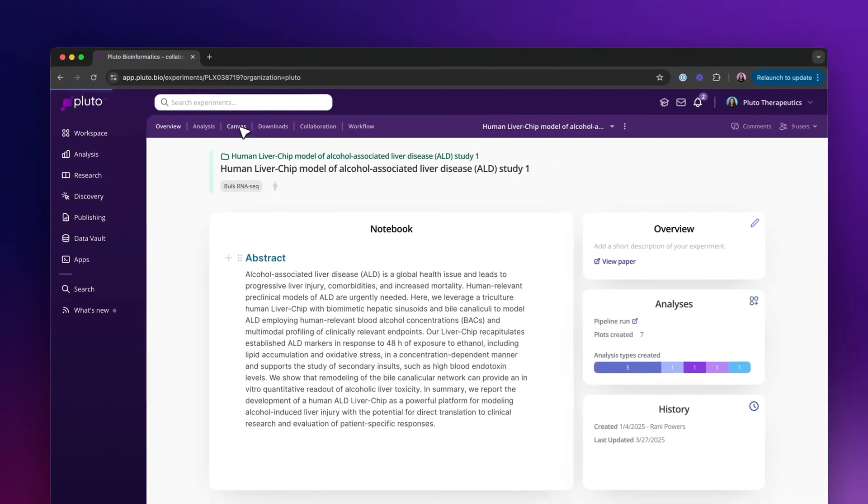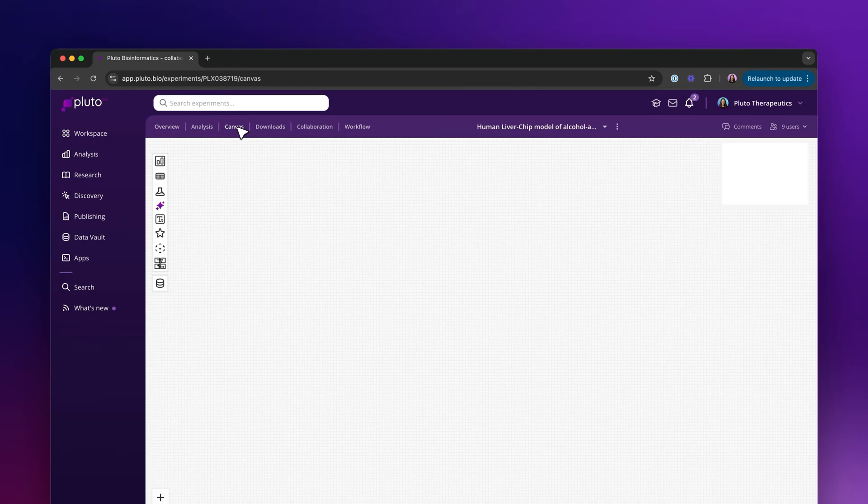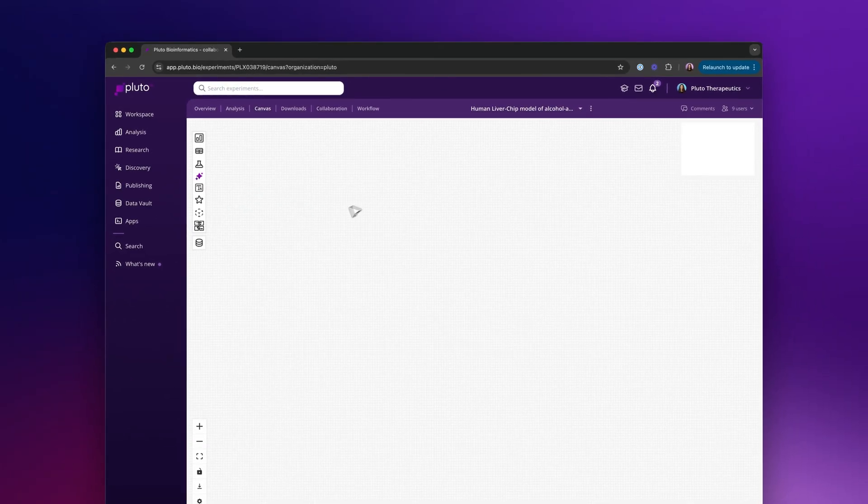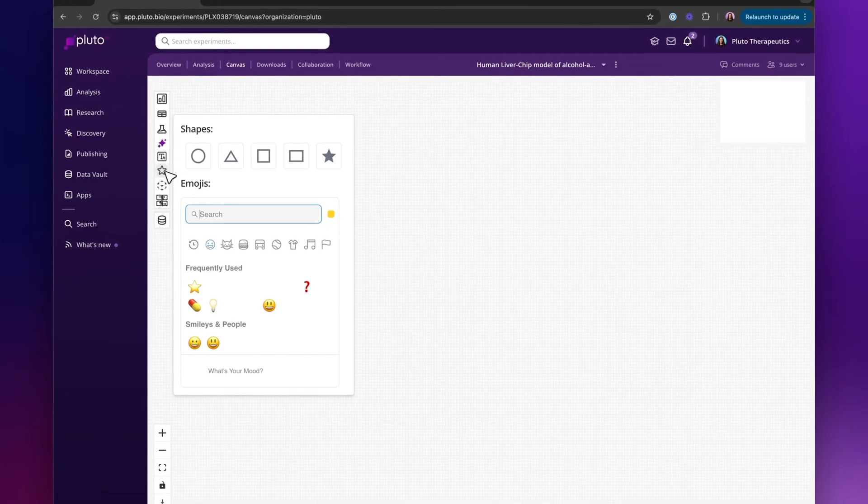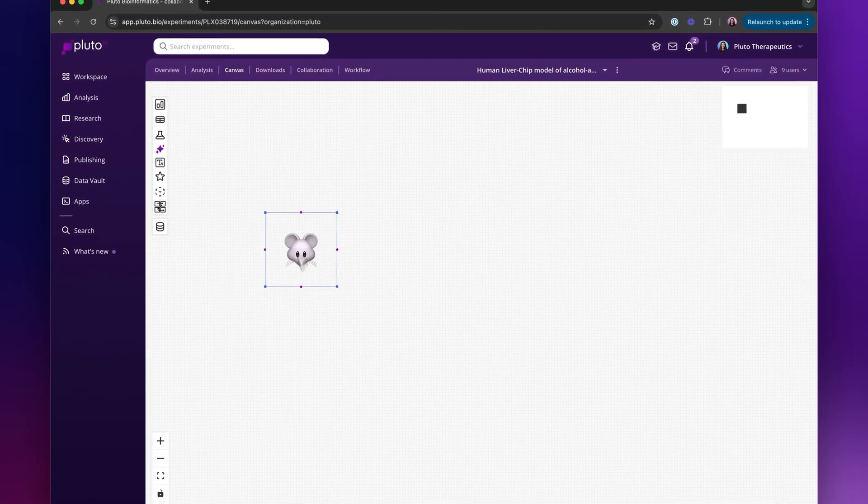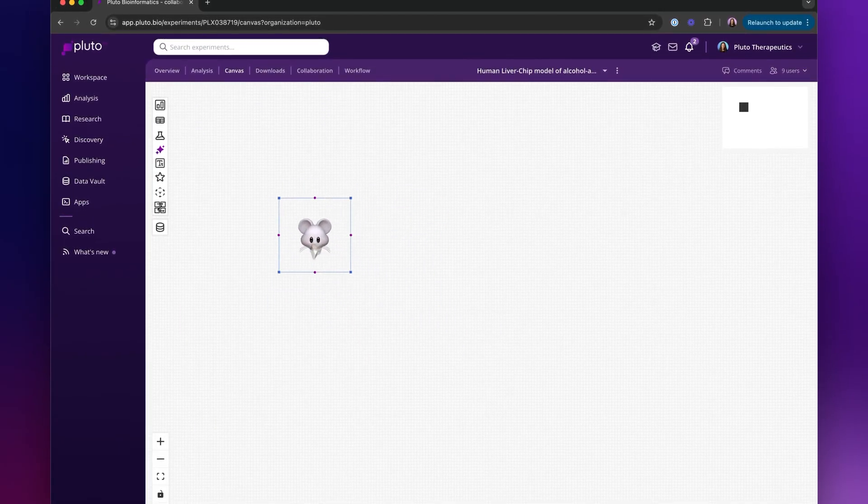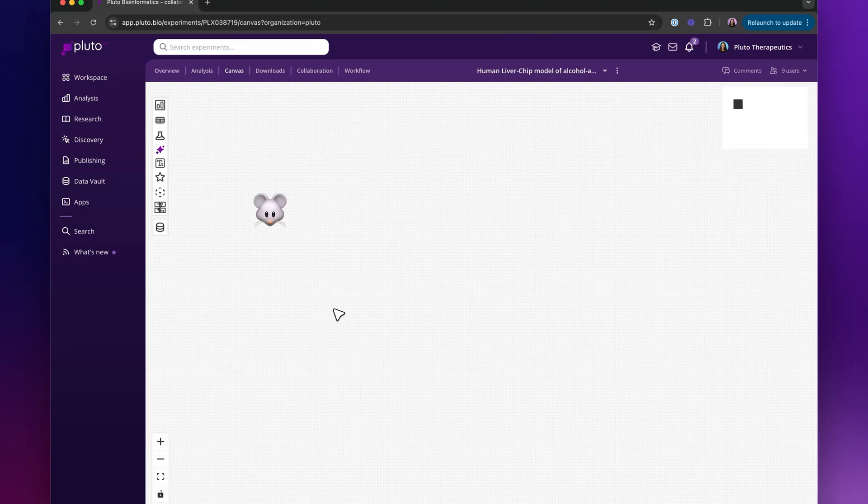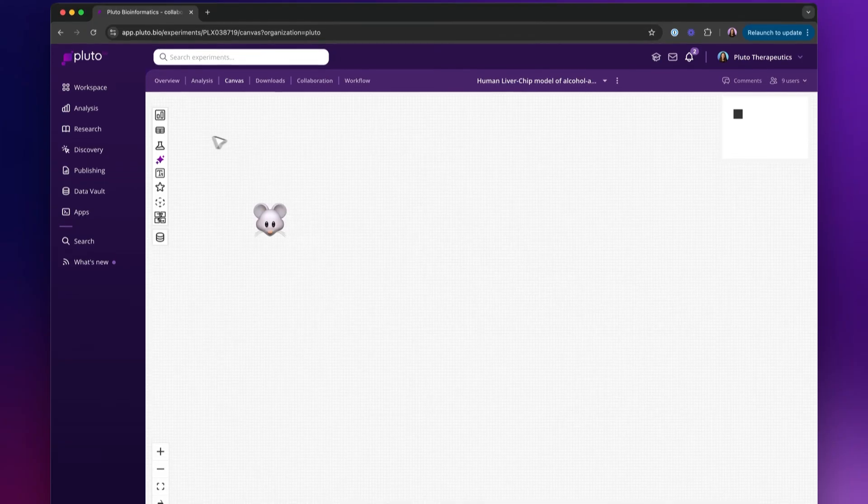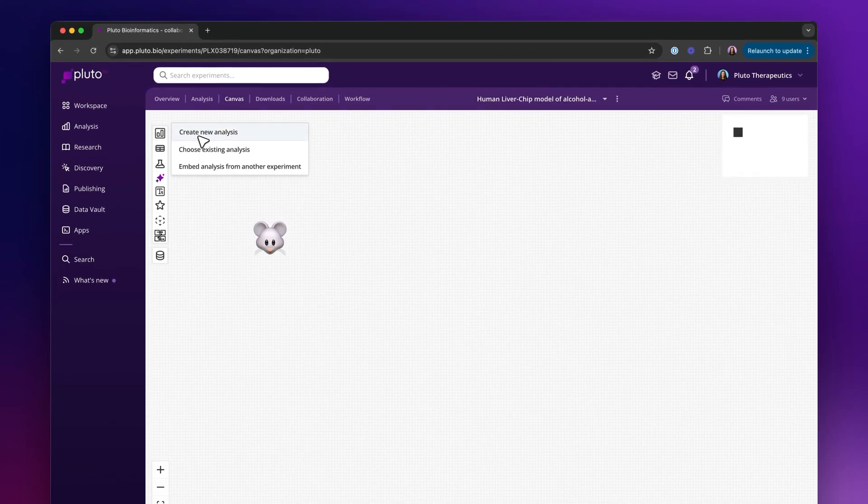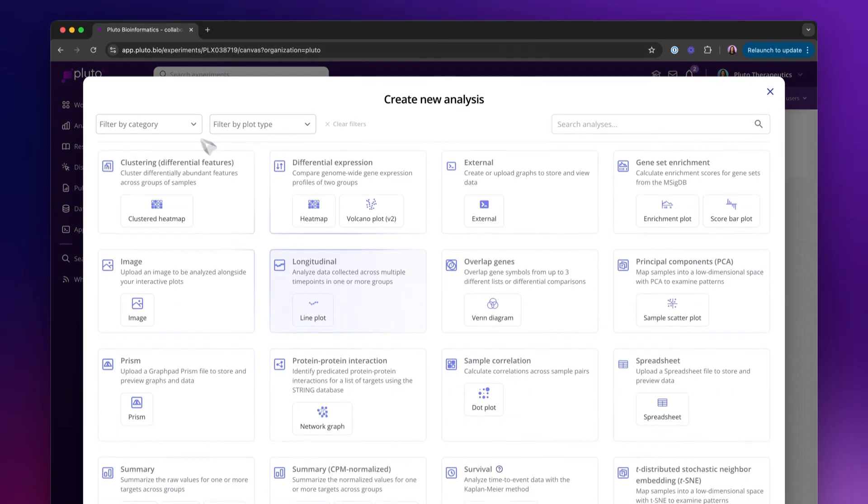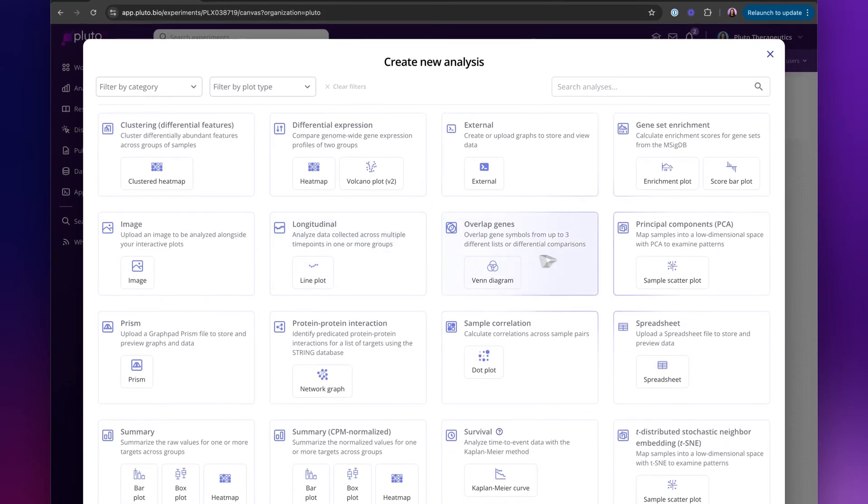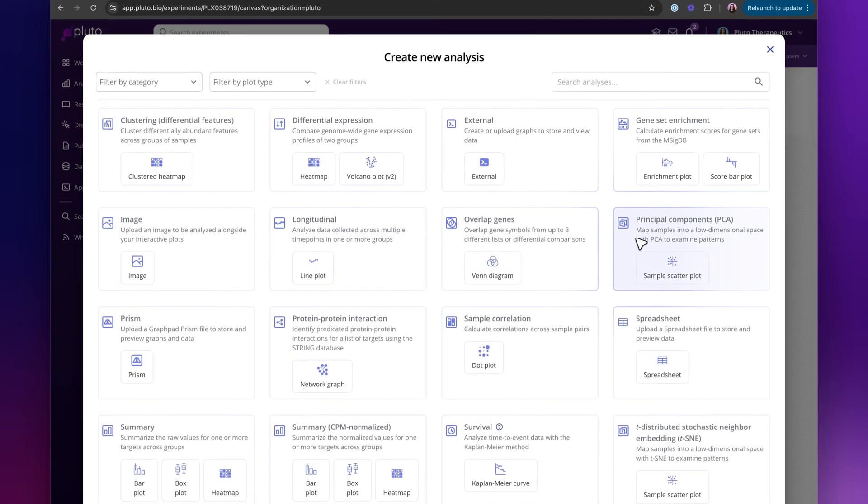On the canvas tab up here is where we can begin performing our analysis on an infinite canvas. This canvas allows me to add different entities to it and tell my scientific story. So I can begin by creating a new analysis and selecting from our no-code analysis catalog here.